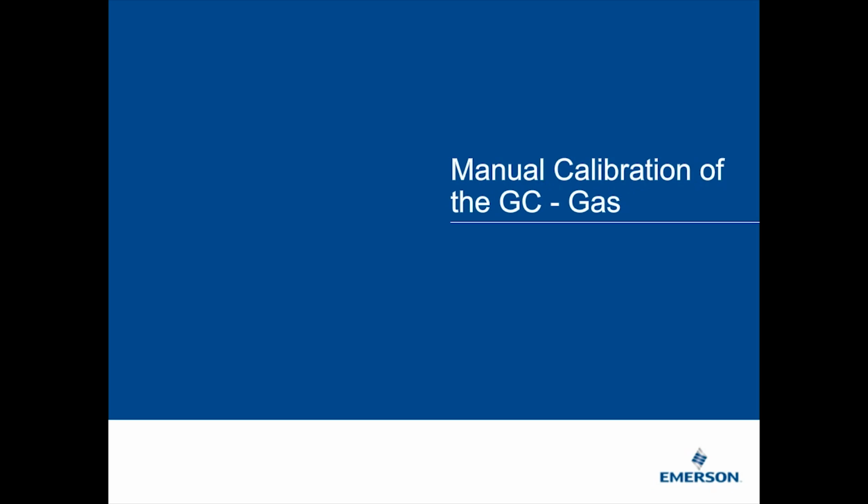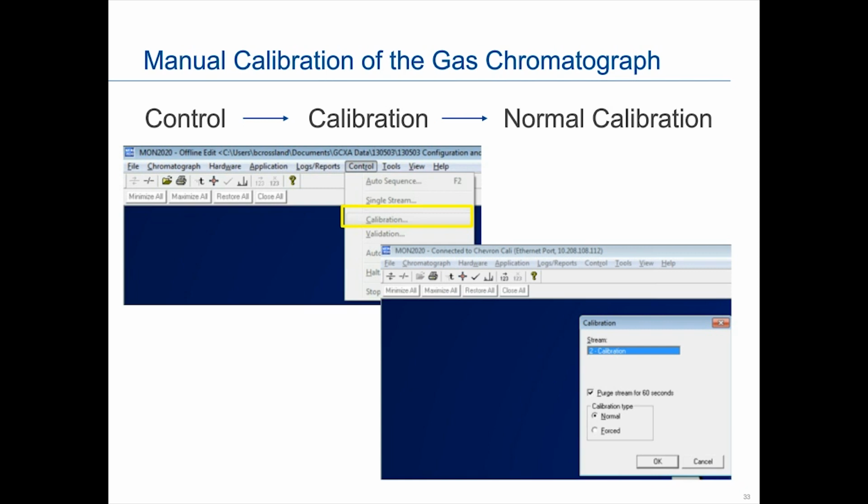Okay. So it's slightly different when we do a manual calibration, whether we're going to do a gas or a liquid. So this particular one, I'm showing you as a gas. So you'll go in under Control, select Calibration. Then the next screen is going to come up, and you're going to select Calibrate. We recommend that you Purge, as well as mark calibration type as normal. And normal basically means the stream will be updated with the calibration data unless the data is outside the accepted deviations.